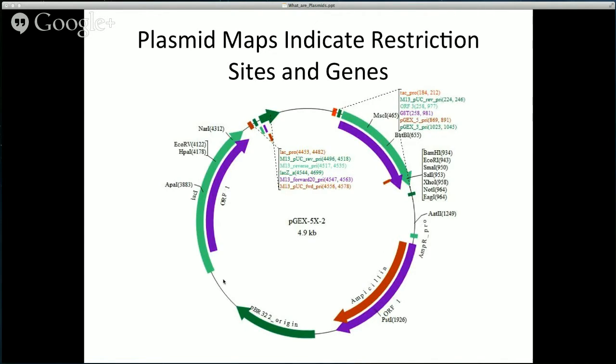For certain anatomy of this plasmid, we have the lac gene and the origin of replication. Here we have what is called a multiple cloning site, an MCS. This tells us that we can insert different genes into this area, when we want to insert certain genes into it, because of different types of manipulation. And that's basically what you saw in Lab 7.